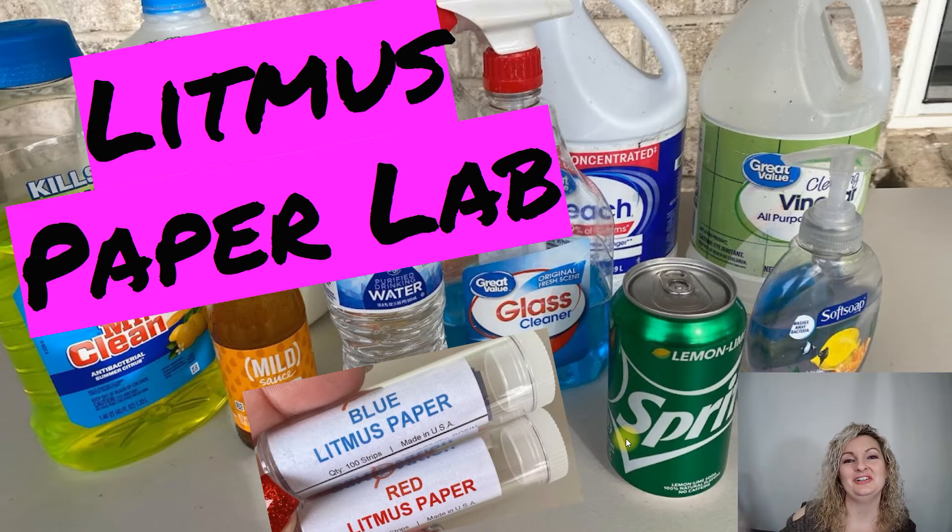Hey everybody, Mrs. Bodishan here. So today we're going to be doing a litmus paper lab to find the pH of substances, particularly if it's an acid or if it's a base.